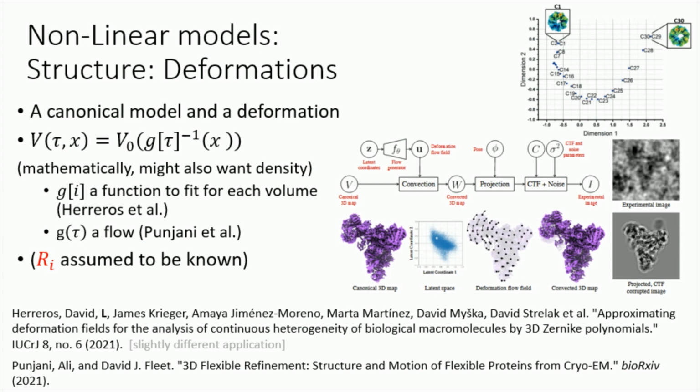So one approach for modeling that evolved was deformations. You have some kind of reference model, and all the other conformations are deformations of this reference model.